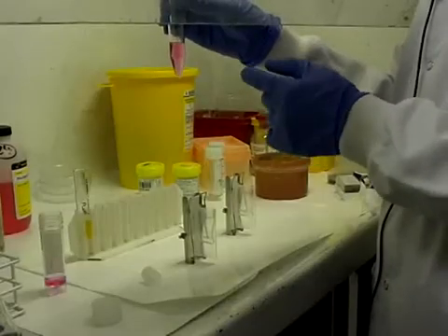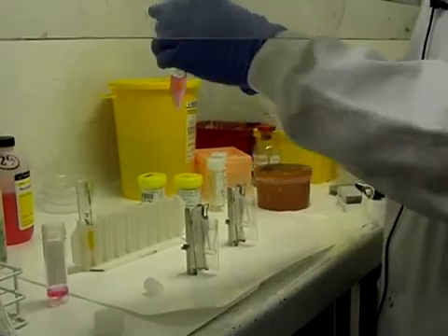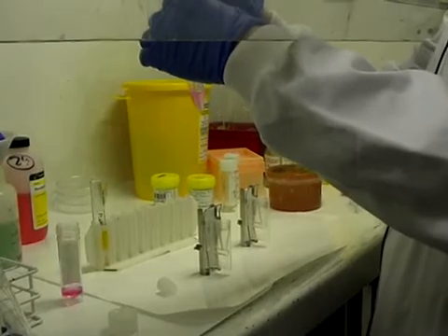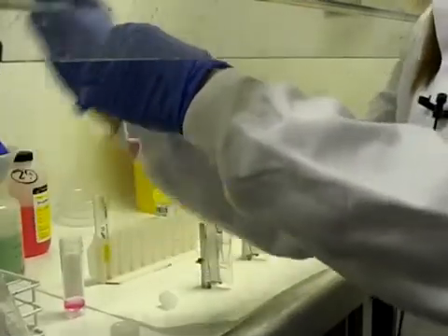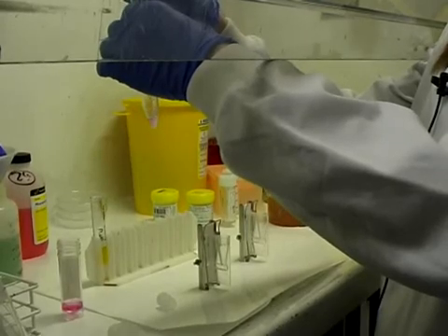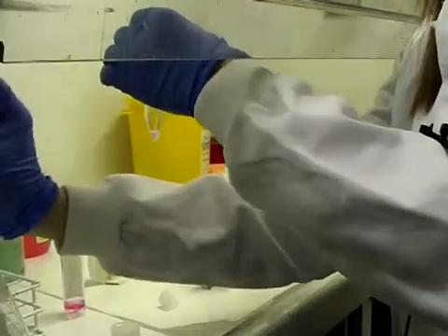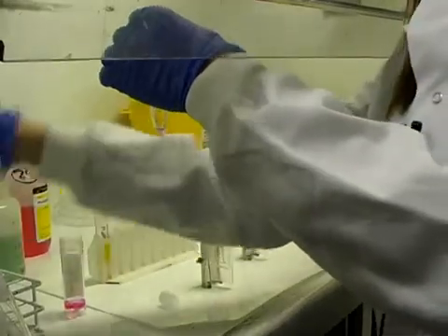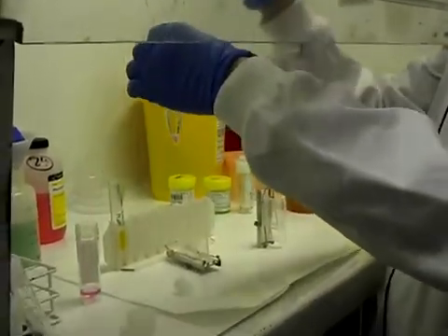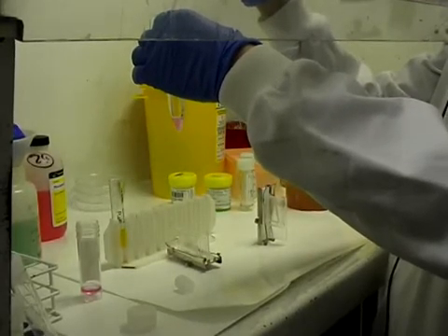Once we've added the preservative and we've spun the sample again and we get a pellet, we have to remove the supernatant down to where the pellet is and we then add 12 drops of more preservative.